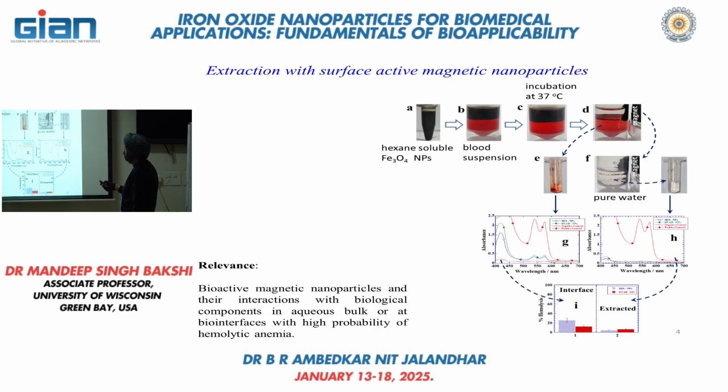So this is the blood suspension. We place them over here. Now, hexane is not soluble in the aqueous phase. Hexane remains in the organic phase, and you have plenty of blood cells over here. The nanoparticles at the interface will start interacting with the blood cells.